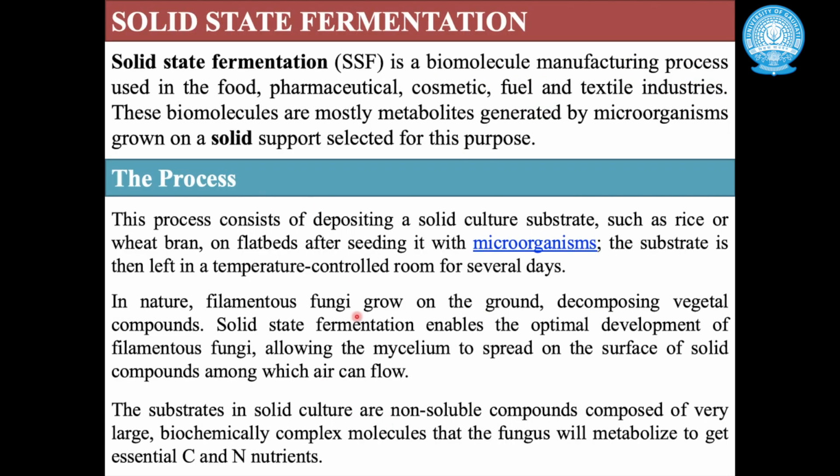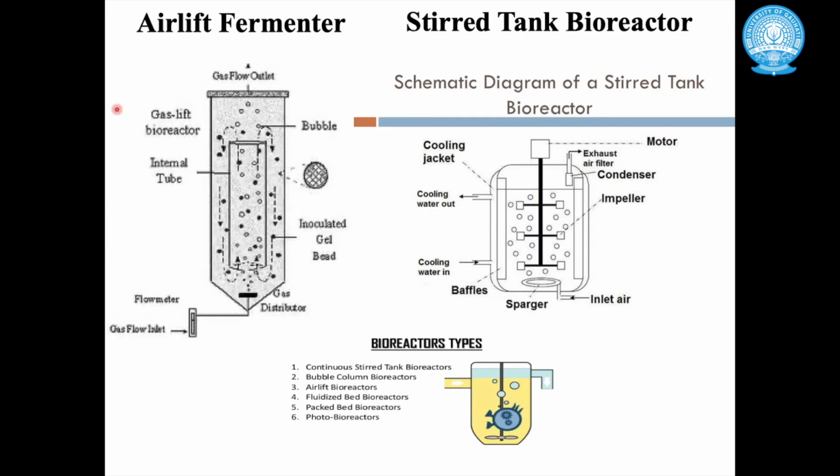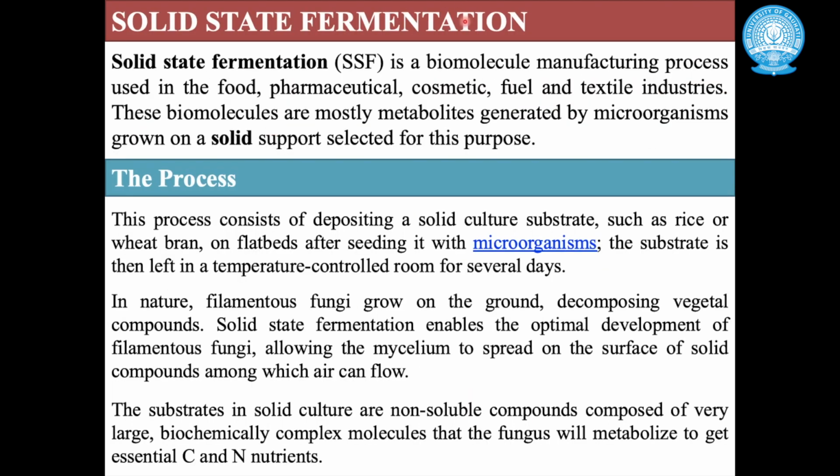We'll go into solid state fermentation and try to understand what it is. It's a biomolecule manufacturing process used in the food, pharmaceutical, cosmetic, fuel and textile industries, and these biomolecules are mostly metabolites generated by microorganisms on a solid support. Unlike liquid media, in solid state fermentation we do not provide any liquid medium. We generally use a solid support to allow microorganisms to grow.